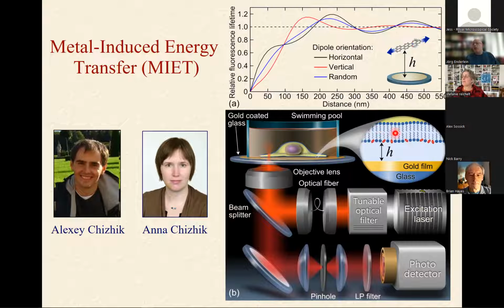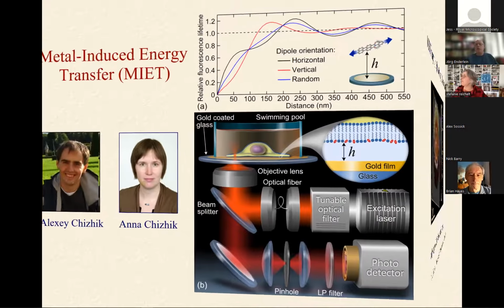So this is all that you need. You need a standard FLIM microscope, and you need this one special cover slide with this gold film. That's the only modification with respect to a normal FLIM approach. So now we can measure intensities and lifetimes, and then we can use our perfect knowledge of the physics behind it to convert the fluorescence lifetime into a distance.